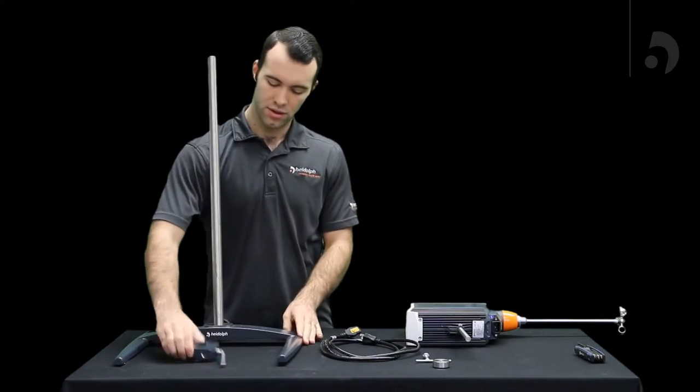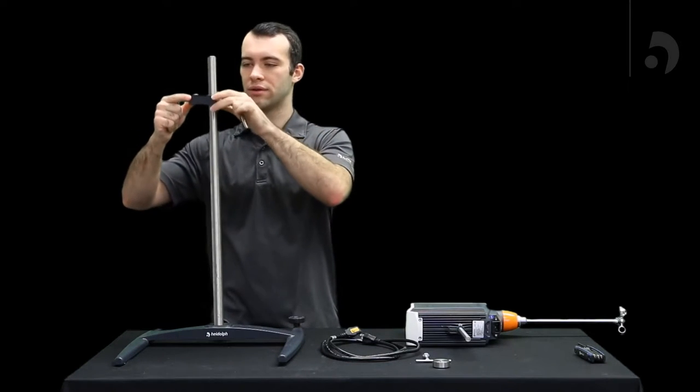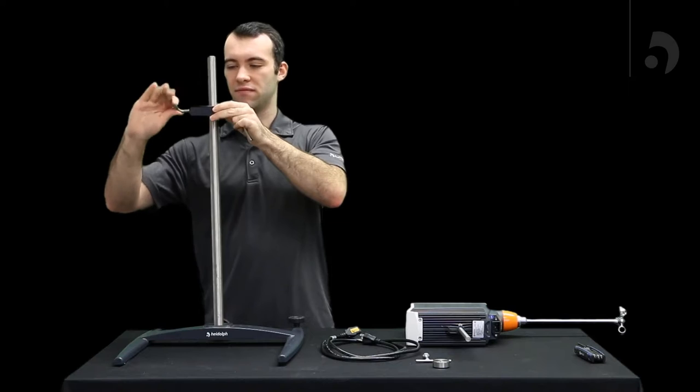Once that rod's in there you can take your universal clamp, loosen it to where you can get it over the rod, and then make it very tight.